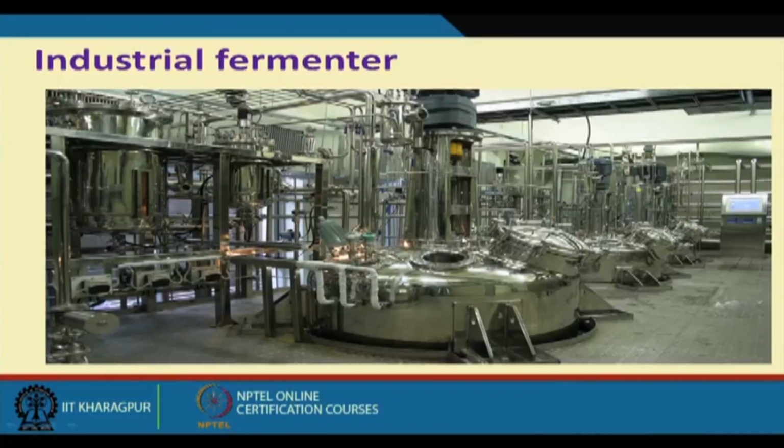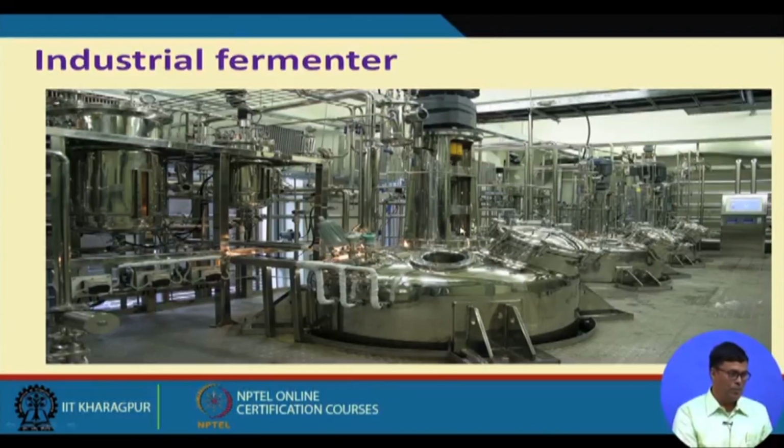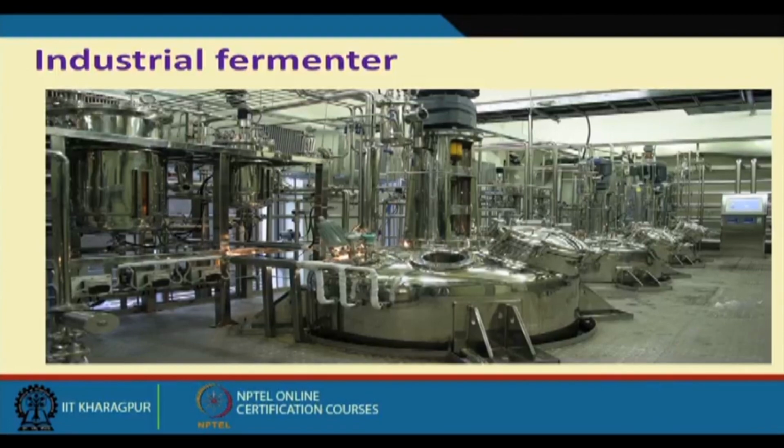If we directly apply this power to the shaft, we can imagine the agitation speed would be tremendously high. So what we do is first put the power into the gearbox. In the gearbox we reduce the speed stepwise, and ultimately whatever speed we want, we transfer to this particular shaft. The whole gearbox is usually submerged in an oil tank.